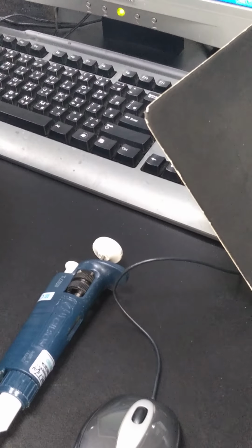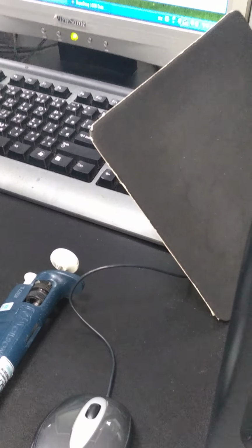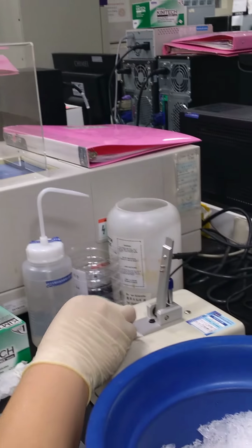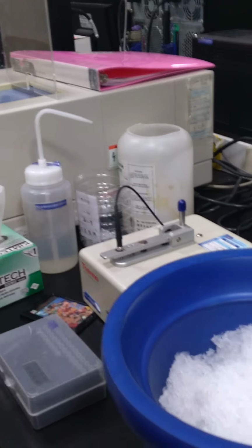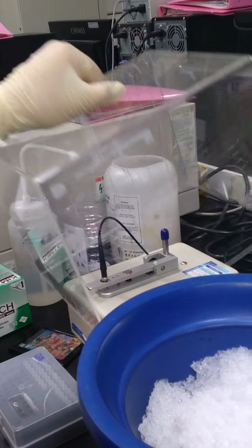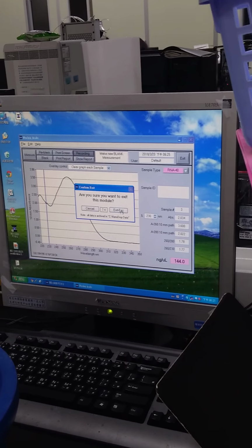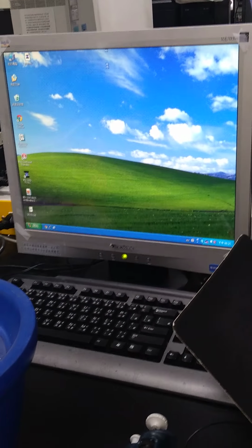So I check with... Clean up after using. This one is for tips and the rest are in that box. Okay. You press it. You want to see for sure or not. You press it. Close your program. Remember to close the computer.